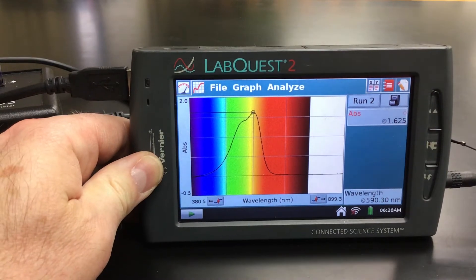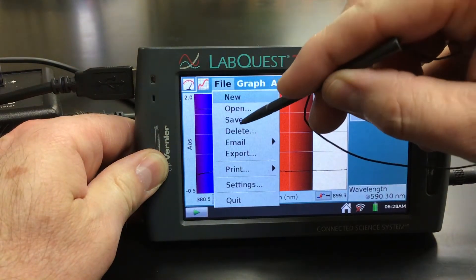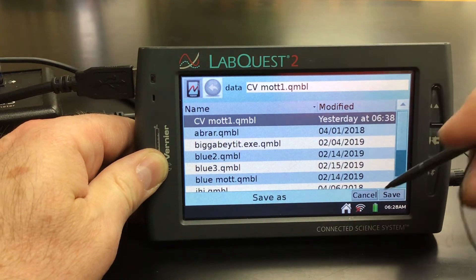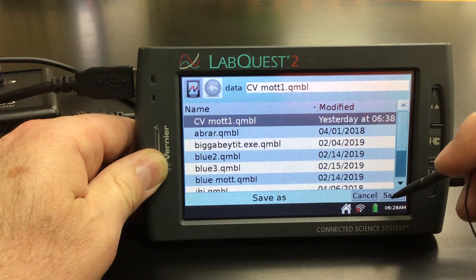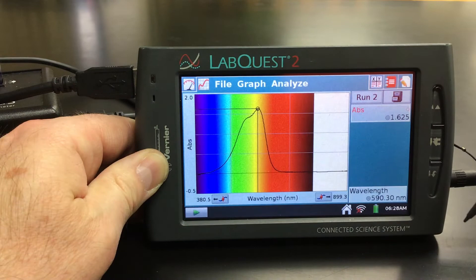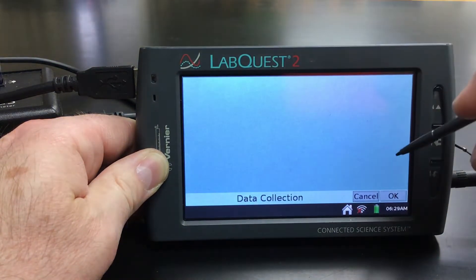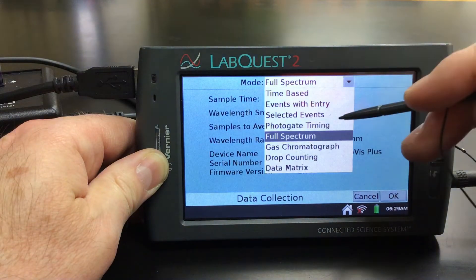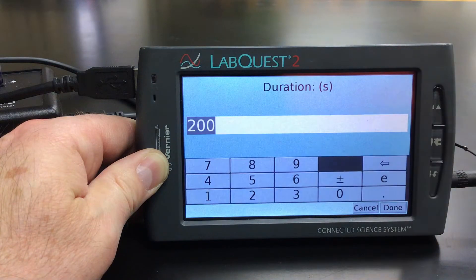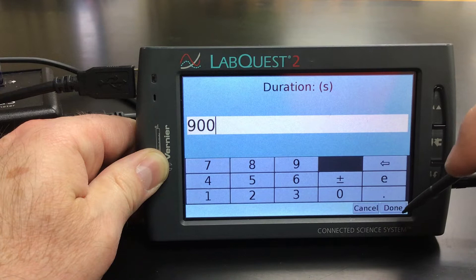We are going to go ahead and save our data. So I'm going to go File, Save. I'm going to save it as the same file, then hit Save and override it. And then I'm going to go top left to change my mode — I'm going to make it time-based. And now it says we want to go for 15 minutes, just 900 seconds. Going to hit Done.